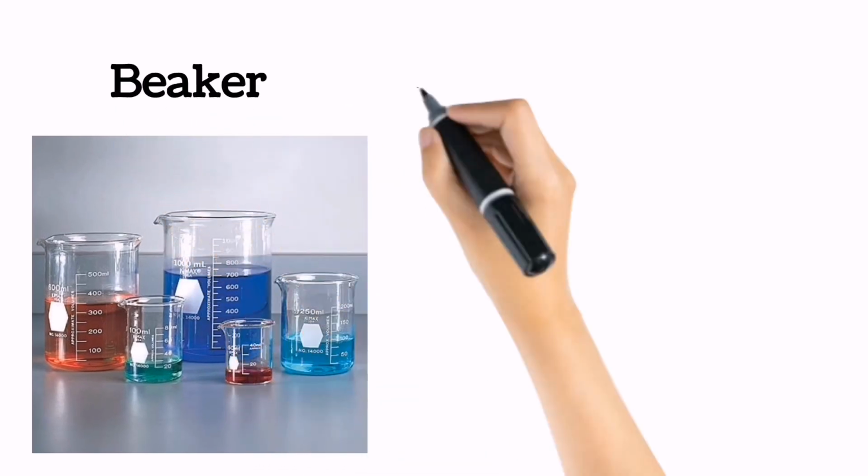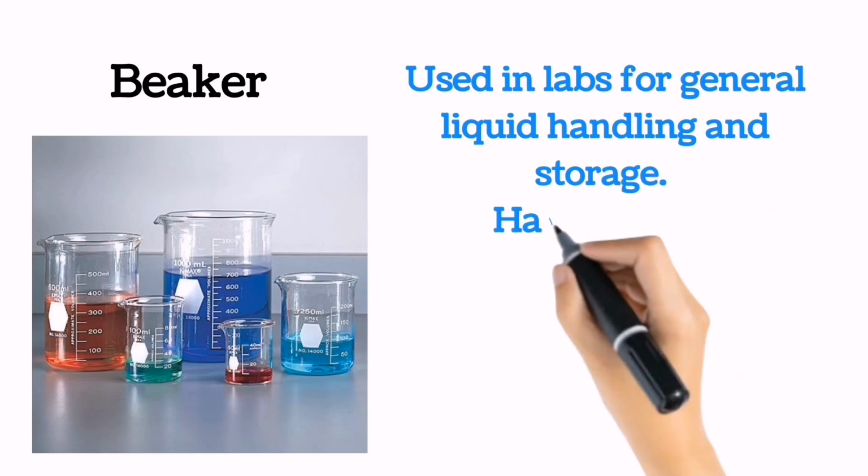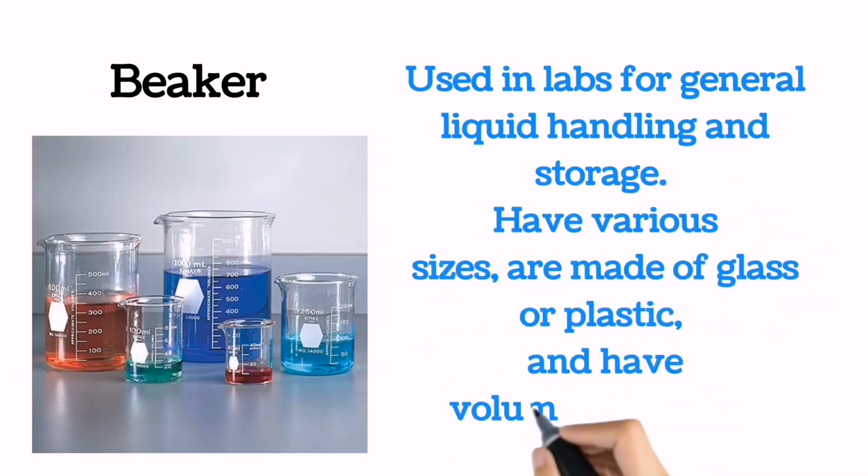Beaker, used in labs for general liquid handling and storage. Have various sizes, are made of glass or plastic, and have volume markings, sometimes used to heat chemicals or solutions.